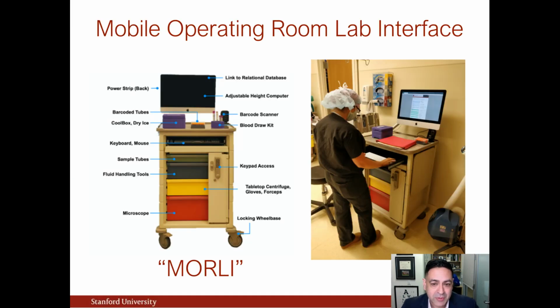So one of the first things that we did was address the question of how do we get dry ice into the operating room? How do we do advanced molecular biology during the sample collection?